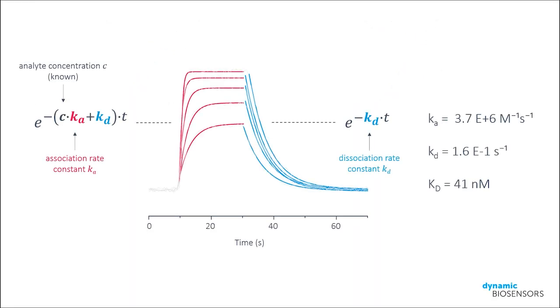Okay, let's have a closer look at the results of the kinetics analysis and rationalize how the Helios software performed the analysis. The software automatically identifies the association-dissociation phases, and knowing the concentrations that have been used for the injections, it then performs what we call a global fit. This means it optimizes the two parameters of interest, namely the rate constants KA and KD, by non-linear least squares fitting, until a best match is reached for all curves at once. This type of global fit procedure is rather strict because the same KA and KD values are used for all curves.